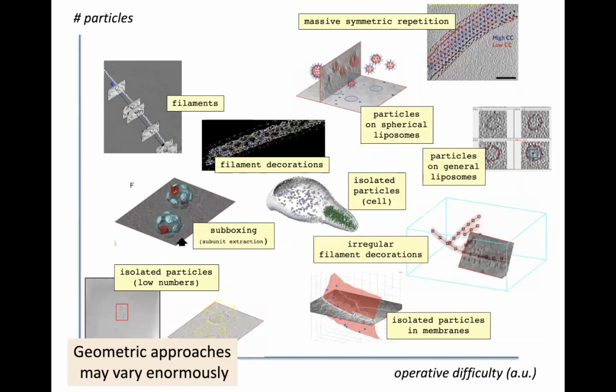That is one thing. The other thing is that tomography inherently can present very different phases. Your particles may be distributed in very different fashions, and it's difficult to establish automated pipelines in order to just access your tilt series, create a tomogram, and inside the tomogram just extract everything that is meaningful for your project.